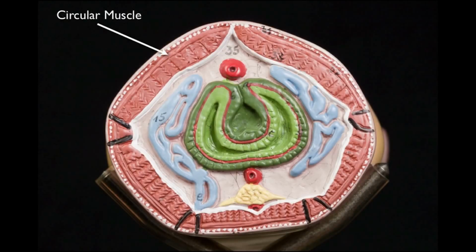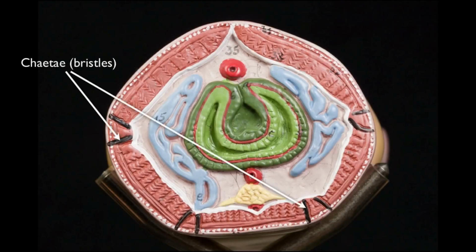Beneath the epidermis is the circular muscle layer, and beneath that layer is the longitudinal muscle. You can also see in this view the chetae or bristles. These are called setae in your lab manual. One of the questions in the lab manual refers to the number of chetae found in one somite. This view can help you to answer that question.